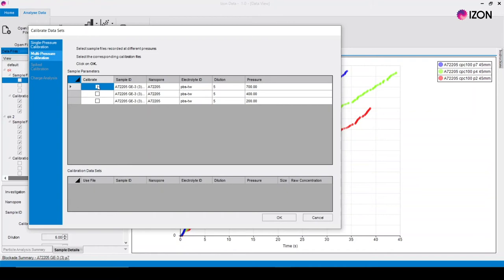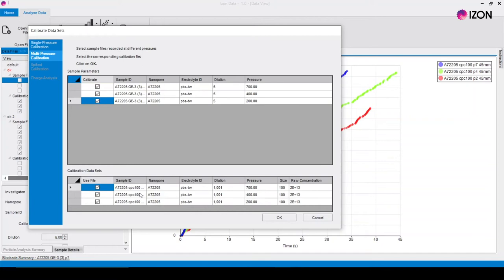Select the samples you want to calibrate and the calibration files with identical parameters will be displayed in the list below. Make sure the calibration files you want to calibrate the sample against are selected and click OK.